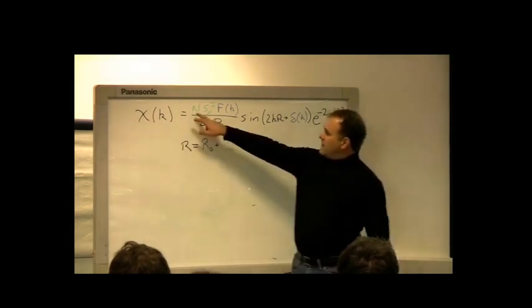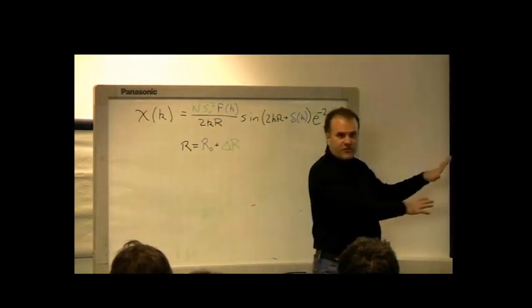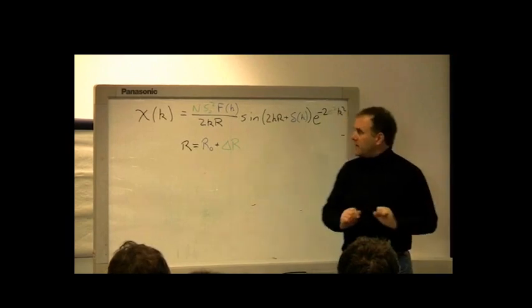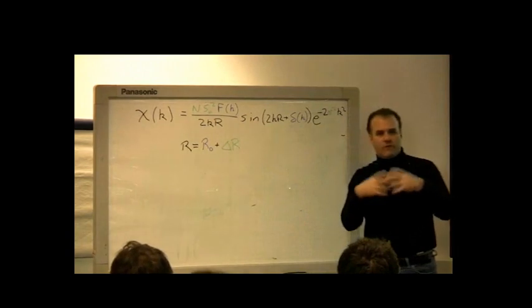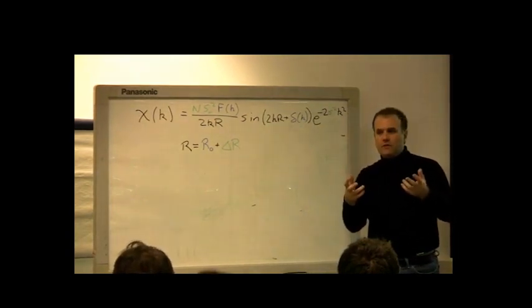This is a crystalline material. We know that N is 6. And S0 squared is this so-called passive electron amplitude reduction factor or some such thing.